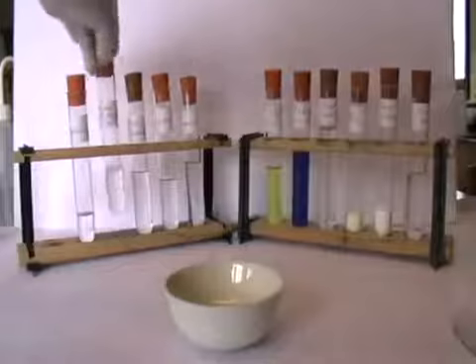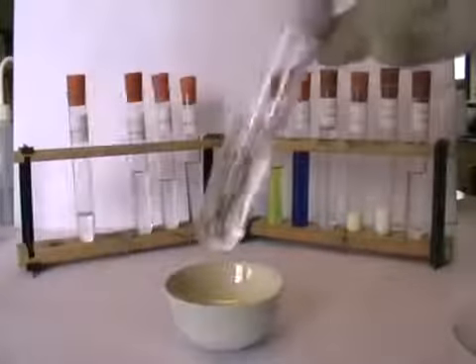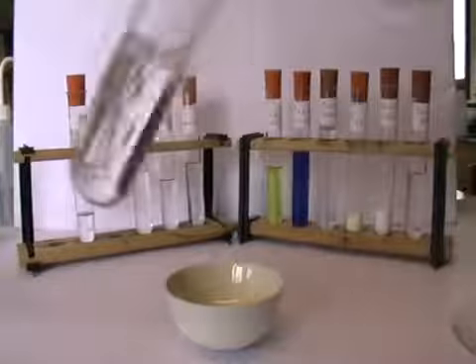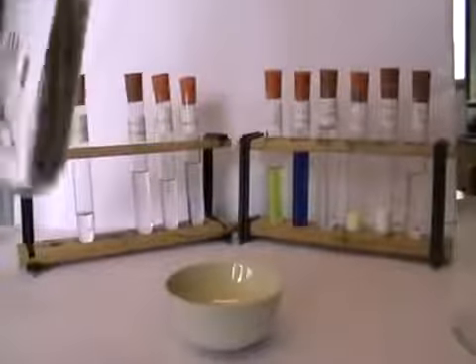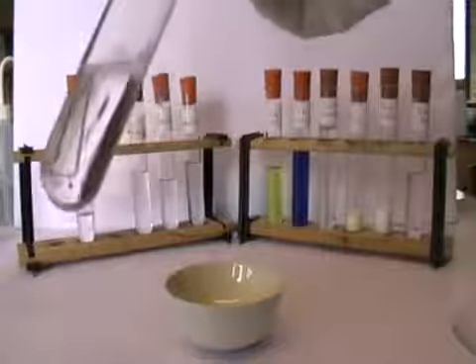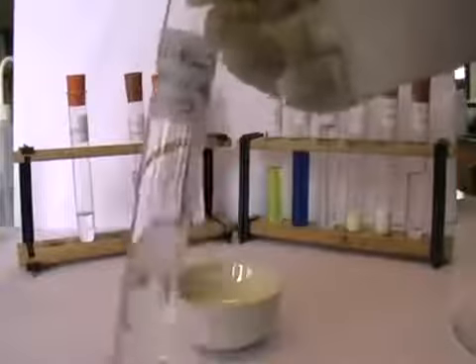So that's our ethanol. Let's take the glacial ethanoic acid, see if it is flammable. Again, let's take a look at its physical appearance. It's a colourless clear liquid. In terms of its smell, in its concentrated form, it can be described as having an acrid smell, also of course described as having a vinegar type smell, strong vinegar smell.